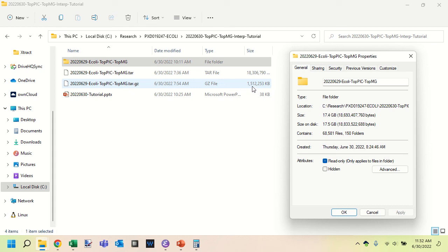Here you can see that in 1.5 gigabytes, I'm able to store what would be 17.5 gigabytes on disk. That's kind of a surprising factor for a lot of folks, but the reality is that HTML and JavaScript and text objects all zip up really, really well. So you could use something like 7-Zip under Windows to shrink these all up to a file and keep the report for posterity, but not have it taking up a huge amount of space on your file system.